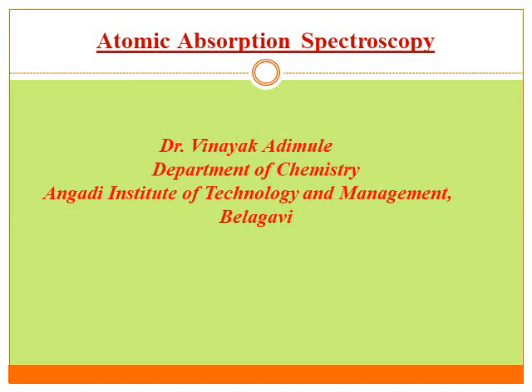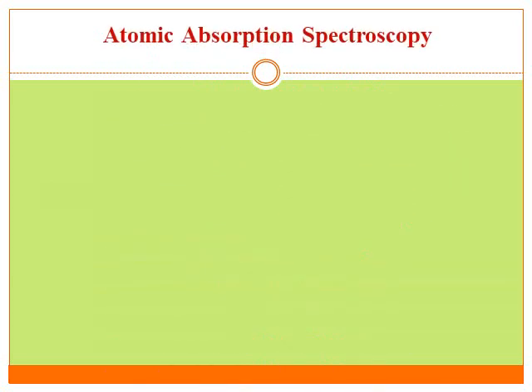So, good morning, students. Today we will discuss another instrumentation part, that is atomic absorption spectroscopy. This atomic absorption spectroscopy deals with the absorption intensity. As the heading itself indicates, it is an absorption spectroscopy, not the emission intensity, as in flame photometry. The reverse of it, that is the absorption intensity, is calculated. So that is the name given, atomic absorption spectroscopy.